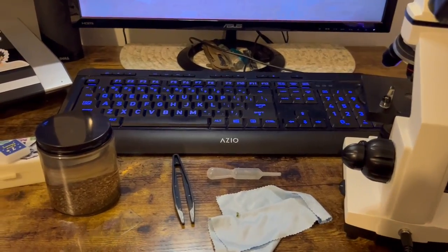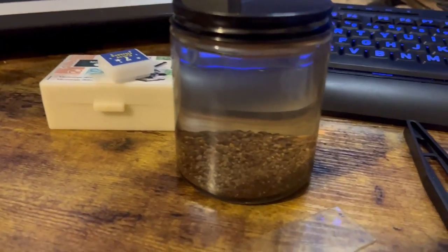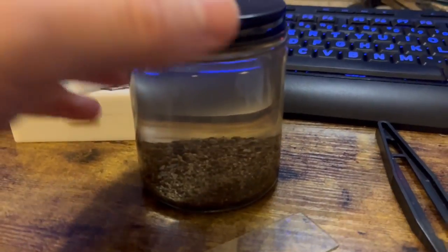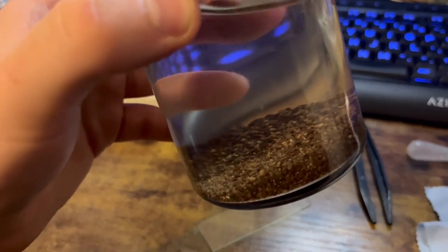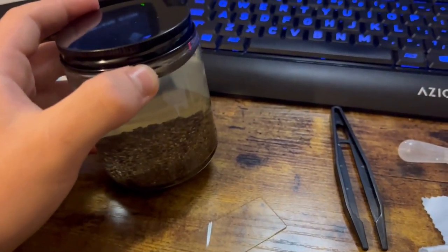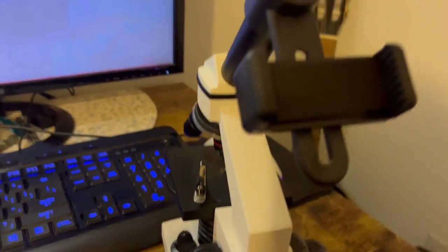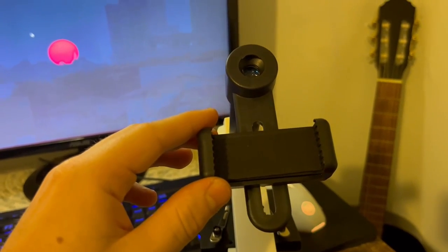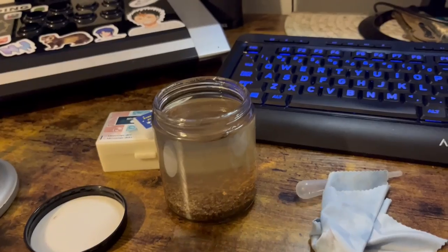All right I'm here at my desk. If you ever wonder what my desk looks like, this is it. This is the setup that I stream and record everything from. So this is the water that I grabbed a few hours ago. It's been a few hours, I actually live streamed, so it has settled a little bit. We're gonna have to stir it up a bit and get some of that sample onto this slide, put a cover on it, and then put that under the microscope.